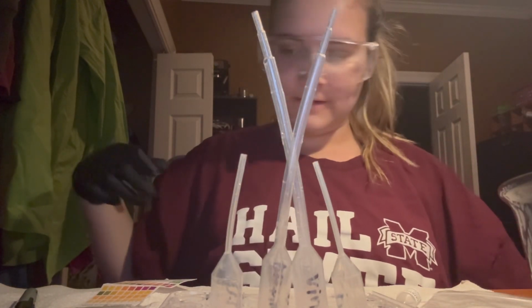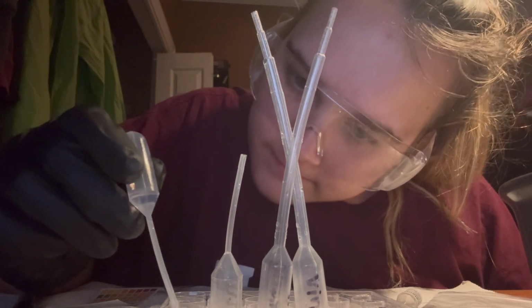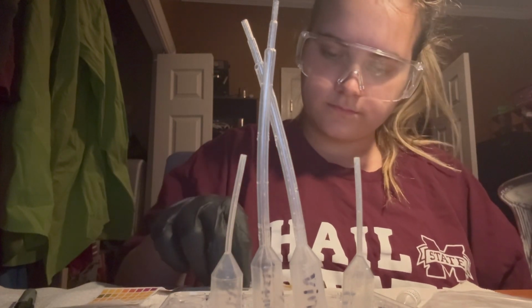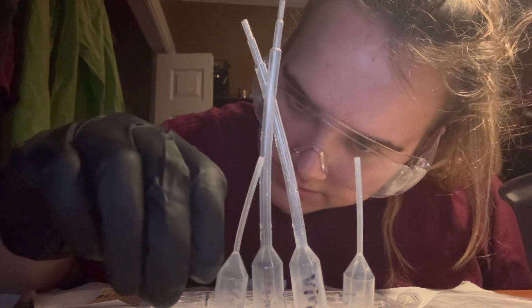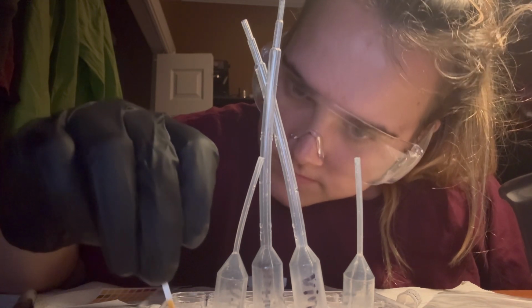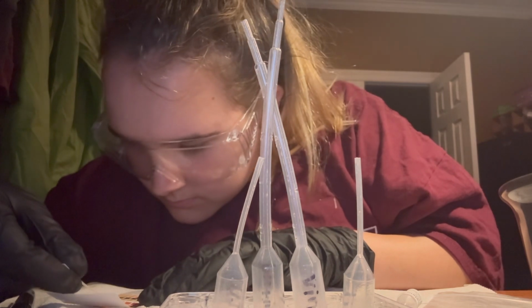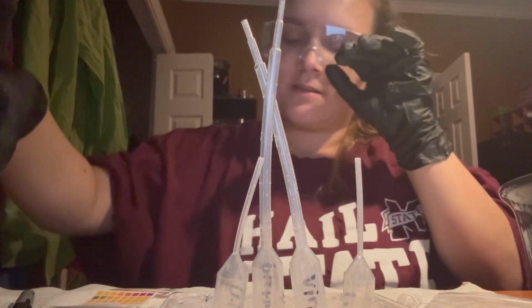Alright, and let's do another one. The D6. Two drops. It will measure the pH. So it's getting a little bit up to the pH of 5. I would probably say like a 4.8 still.